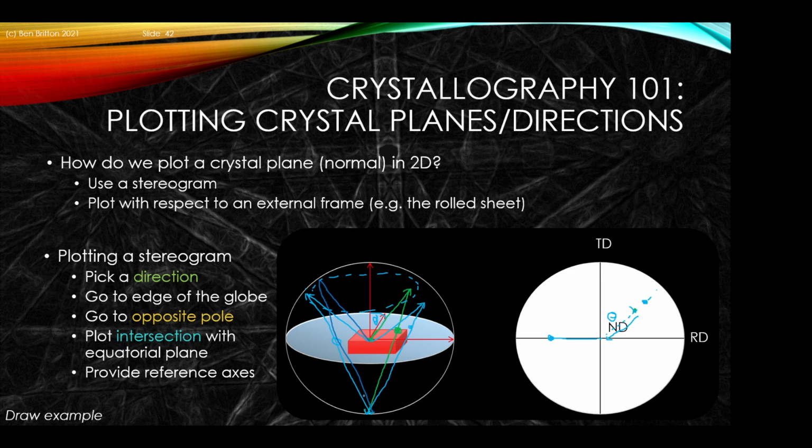It could then go down to the negative pole, plot it there. What will happen effectively is it will sit on this small circle, and that new point would be located there, over there.